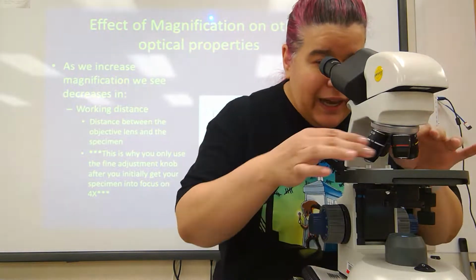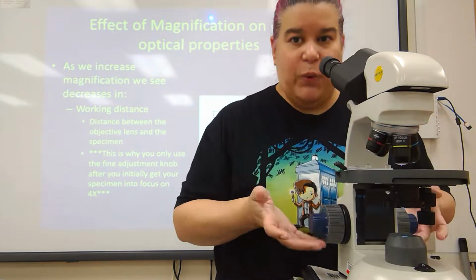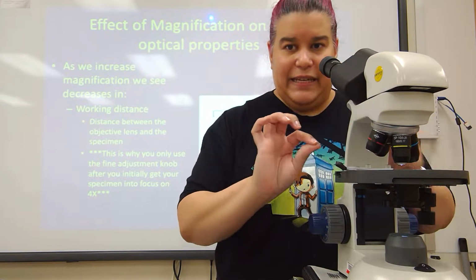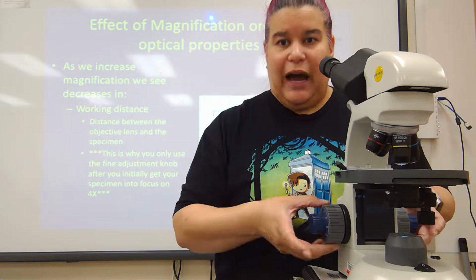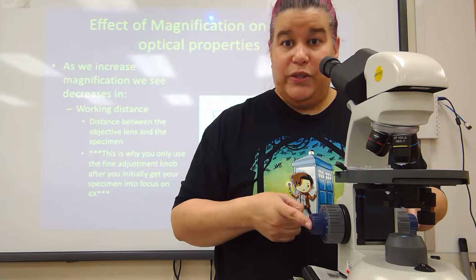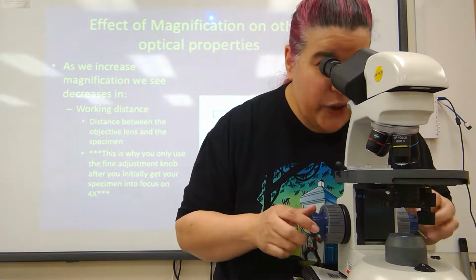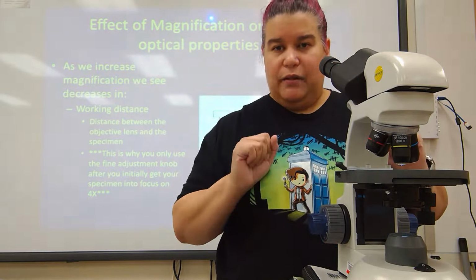So when I switch to the 10x, remember what I said about that distance getting so much smaller, I will never touch the coarse adjustment again. I will only use the fine focus because although it may not be perfect, did you see how much I moved that?